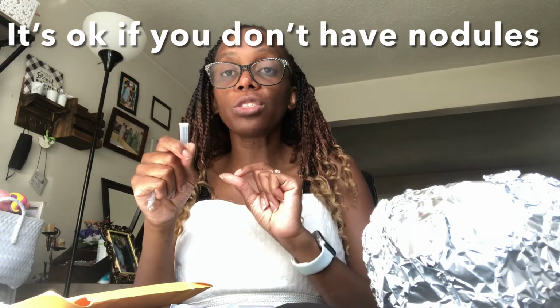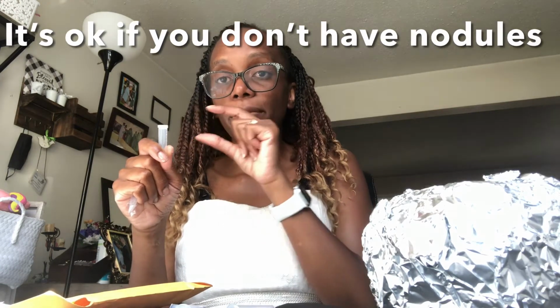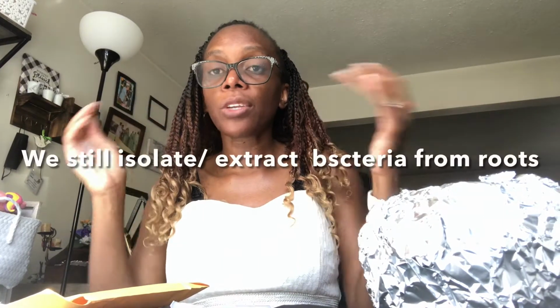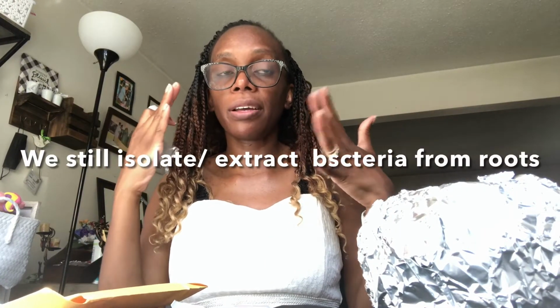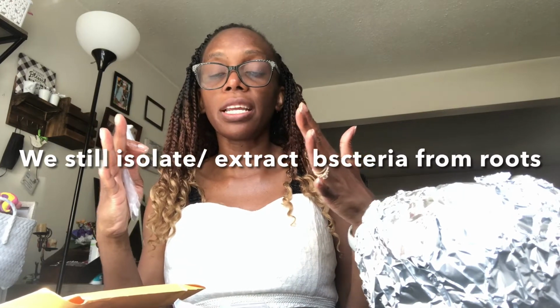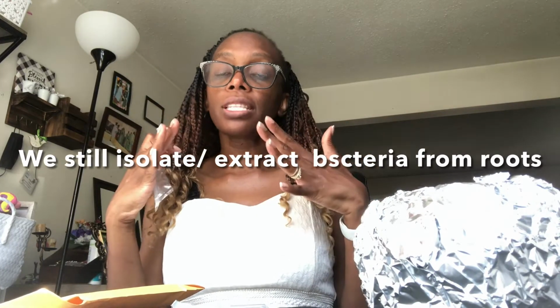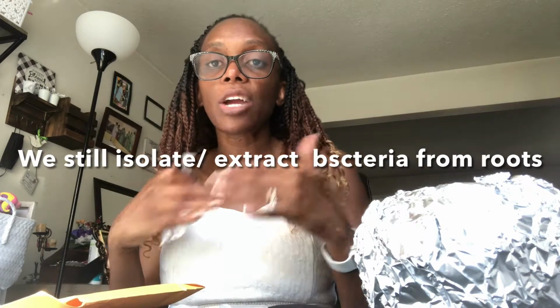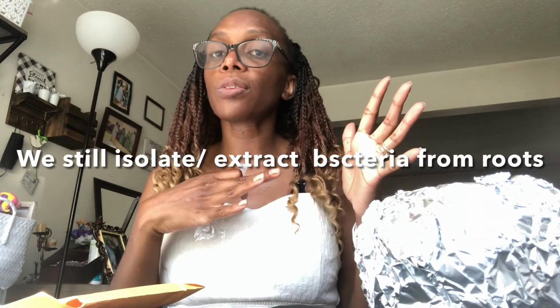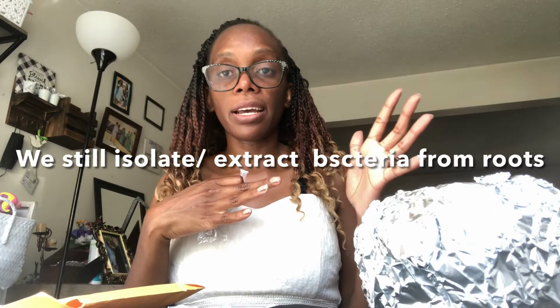If you have no root nodules, then just cut off a segment of the root, because remember that in the signal exchange, when nitrogen fixing bacteria and legumes actually interact, first they communicate. There's this molecular or biological communication where the plant sends signals to the bacteria.